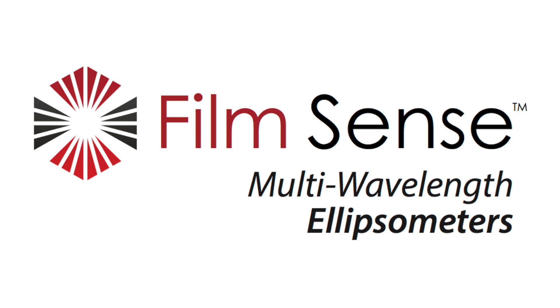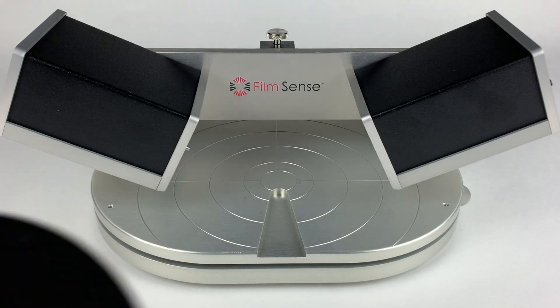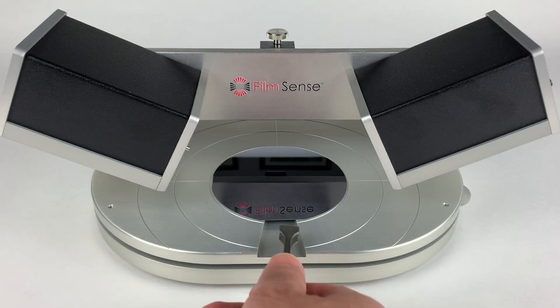FilmSense multi-wavelength ellipsometers are easy to set up and use. To measure a sample, place it on the base of the ex situ measurement frame.